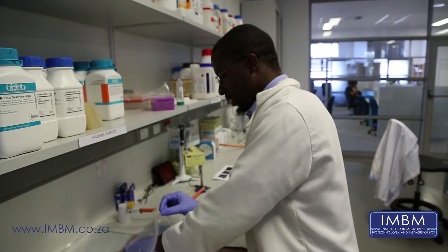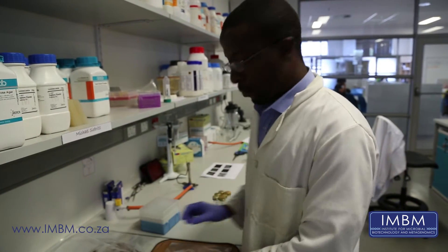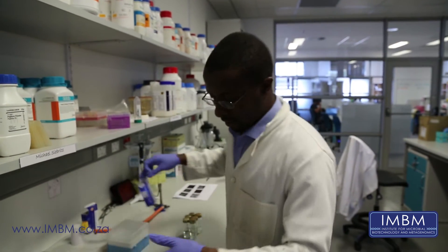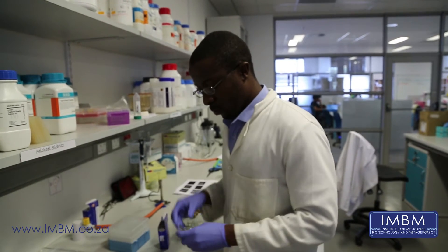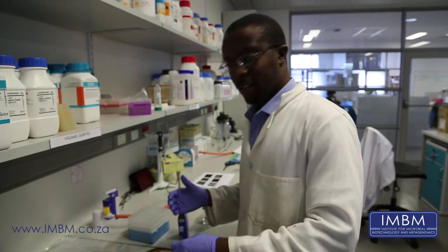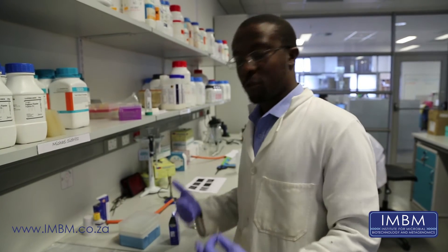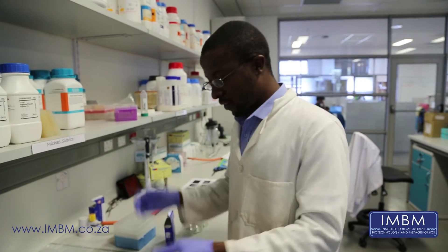Today we will be processing a sponge sample. The reason we're doing this is because we are interested in the symbiotic bacteria that form within sponges. Our hope is that we'd be able to get the bacteria, as we're hoping that the bacteria produce secondary metabolites which are possible drugs that we can use in the pharmaceutical industry.